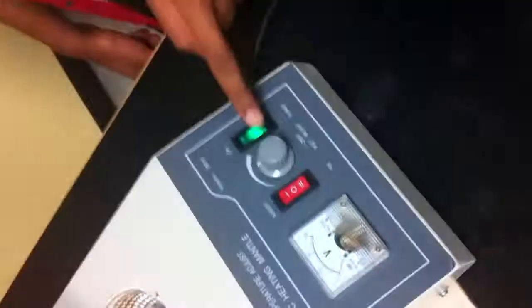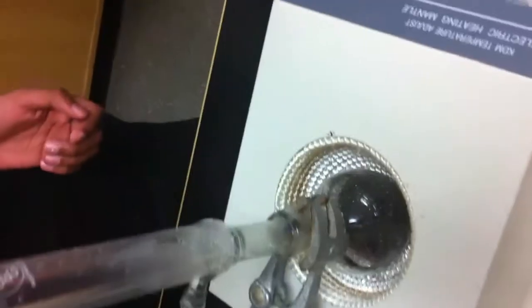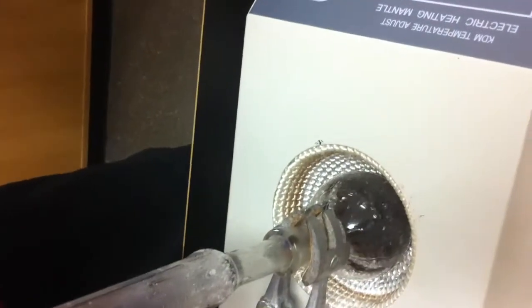Apparently it's contaminated. That's why the color's so strong. But apparently the ester will still work. So we're going to turn it off now. Okay. The condenser. Oh, okay, we're good. When we turn off the condenser, we need to plug it in right away. Take out the condenser, someone. No, wait, lift this up. We need to plug it in right away.